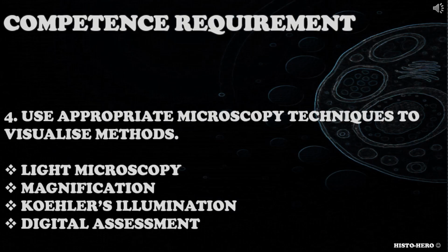The fourth competence requirement is for you to use appropriate microscopy techniques to visualize methods. What type of microscope do you use to visualize H&E? Consider light microscopy, magnification, Köhler illumination, digital image assessment.